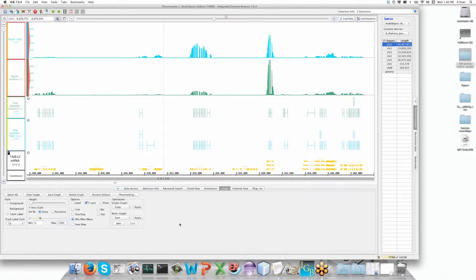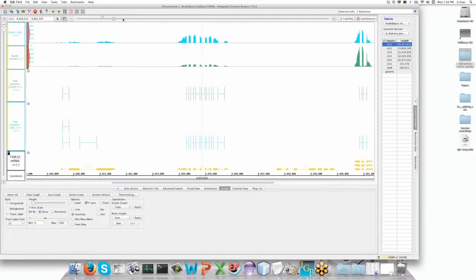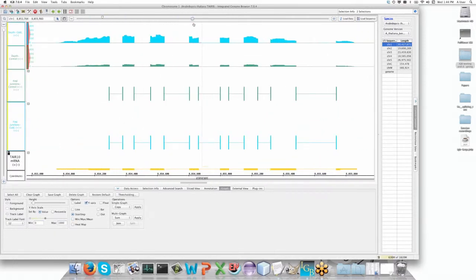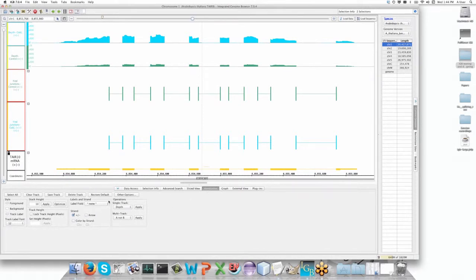We did a webinar last month called Focus on a Feature, where I went through all of the wonderful things you can do with graphs, and that can be seen on our IGBE channel on YouTube. The semantic zoom means that we see more information as we zoom in. One of the great things about IGBE is that on an annotation track you can set a label and show or hide information that's in the track.